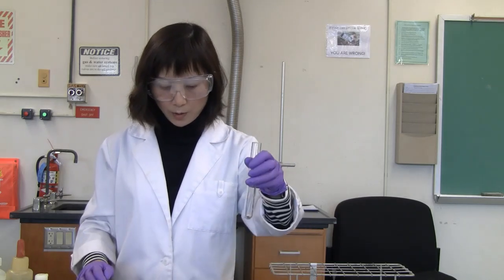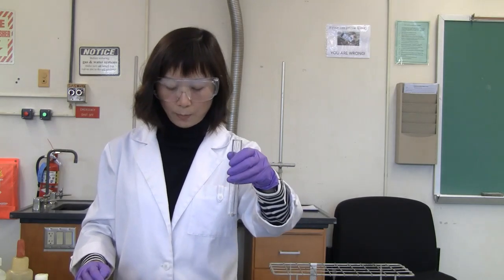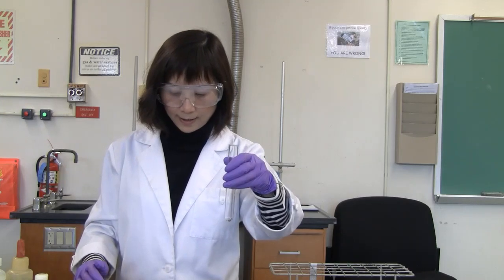That's part 1. So part 2, acetic acid equilibrium. Here, question 1, you can just read and answer question 1. Question 2, I'm going to put 3 milliliters of the 0.1 molar acetic acid into a test tube.